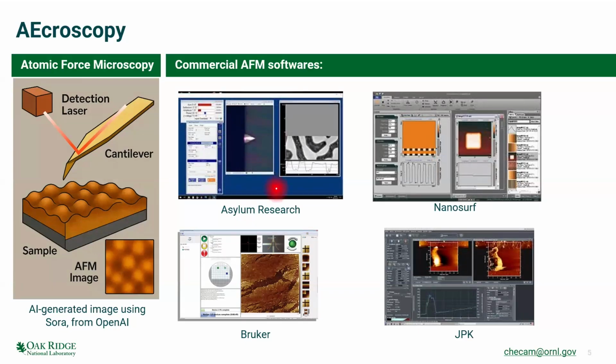And this is how the commercial AFM software looks. Basically, most of the time you can do images in different places of your sample, and you can do force spectroscopy, right? So you can apply force distance curves and record the interaction between the tip and the sample.